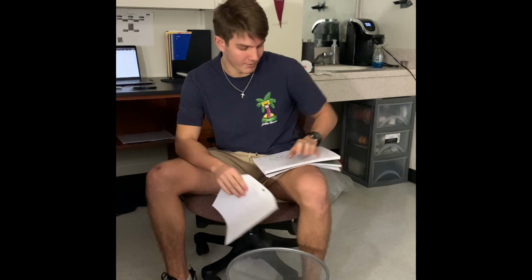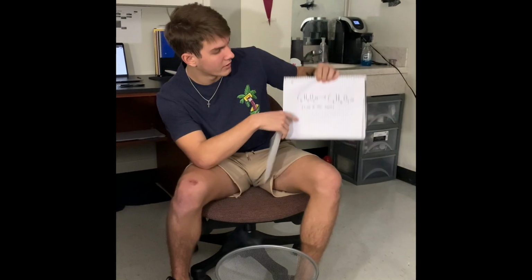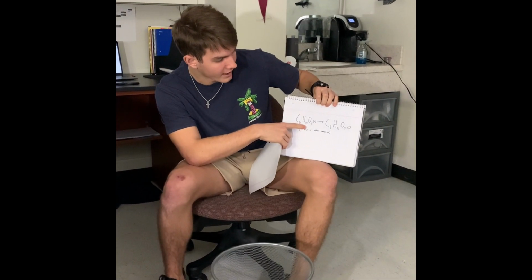I'm in Chemistry 119, Section 625, and today I'm going to be demonstrating the difference between a physical change and a chemical change. So I'm going to be using paper, which has the formula C6H10O5, which is cellulose, and a bunch of other compounds.